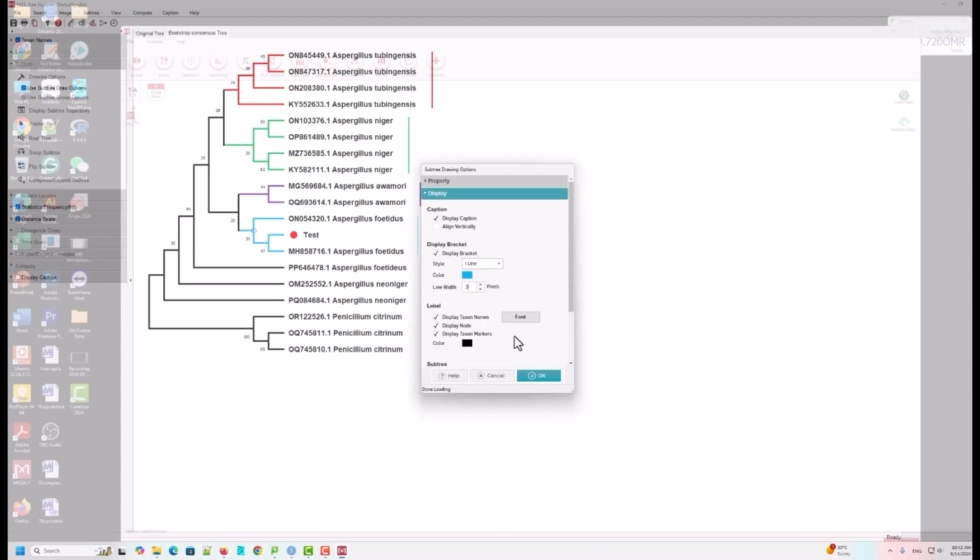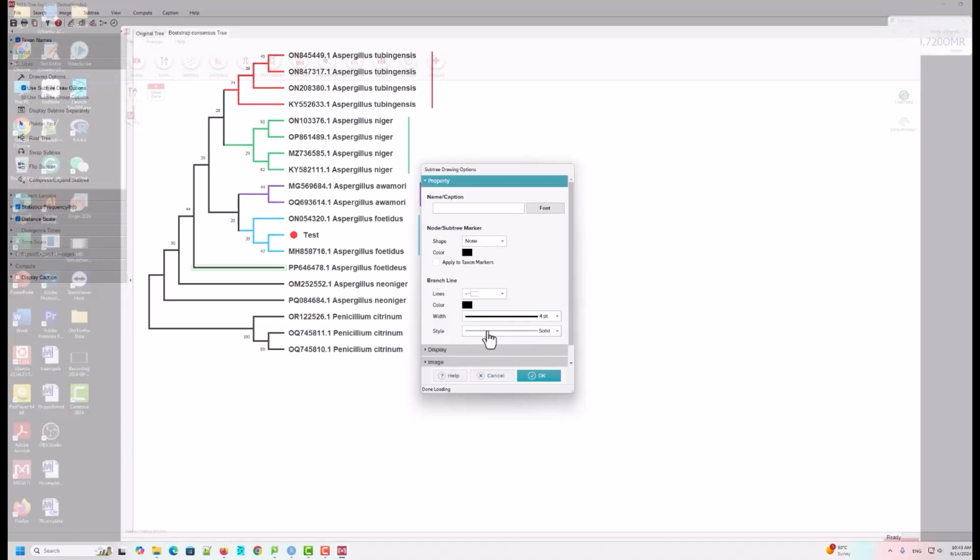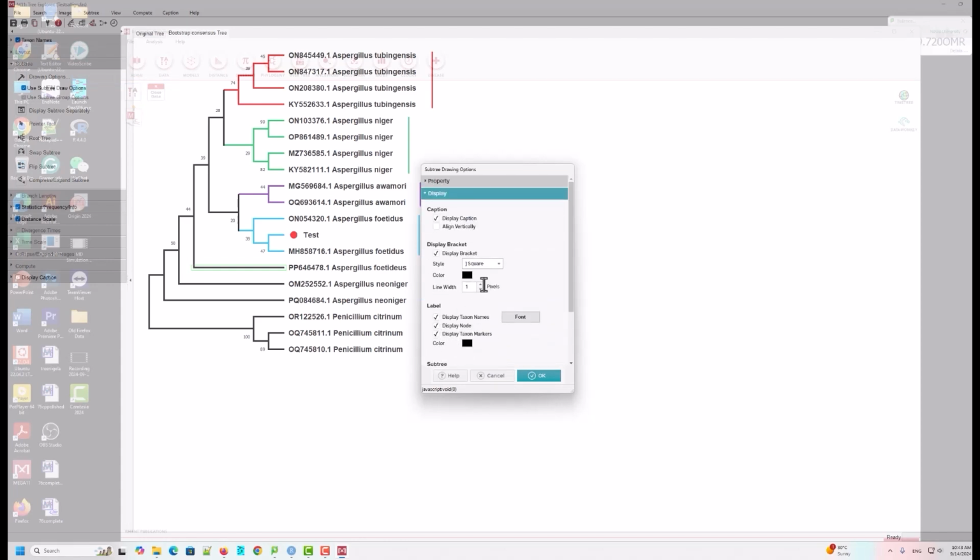Now these are confused species, so you can keep them like this, or you can give formatting, because this is also phylogenetic, but you can give a double color. Why it didn't come out clear is because it means that in the NCBI database there is some problem in this sequence. This is maybe not the same species, because the other three species are in the same clade and this one is in a different clade.